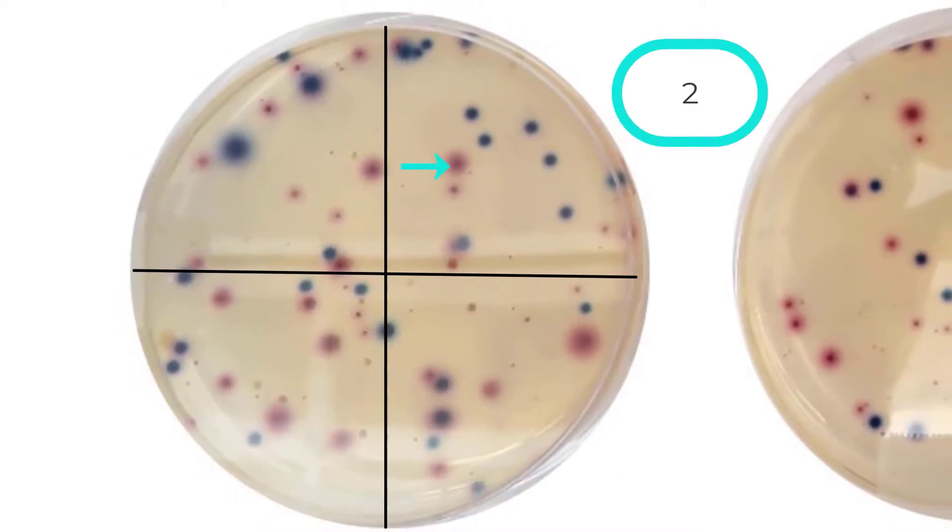Counting the pink to dark red colonies on plate 1 by quadrant: there are 5 colonies in the first quadrant. Continuing clockwise through the remaining quadrants, the count reaches 28. There are 28 other coliform colonies on this plate.